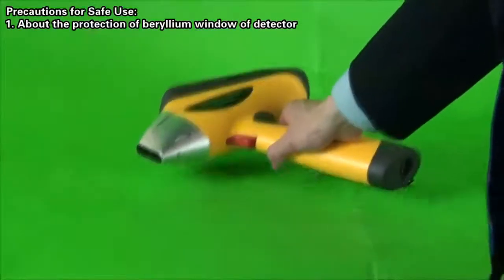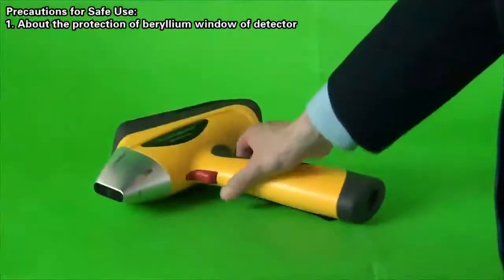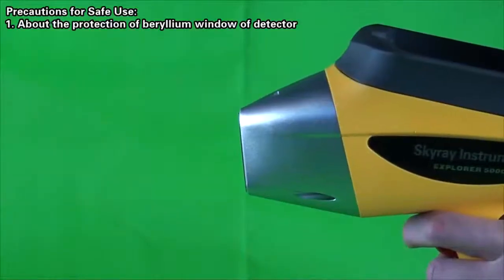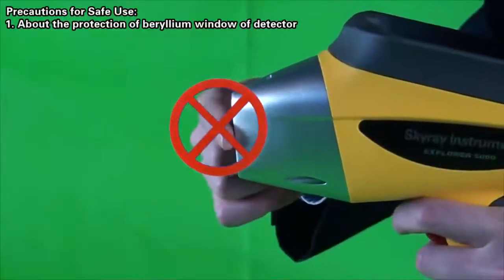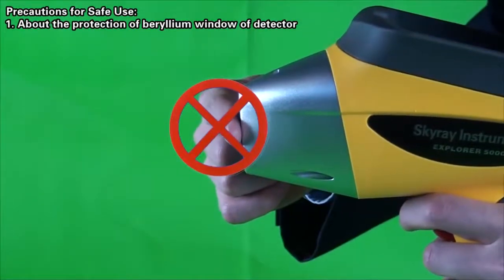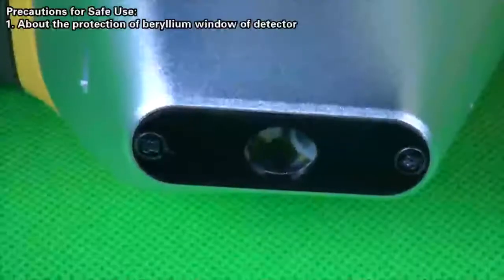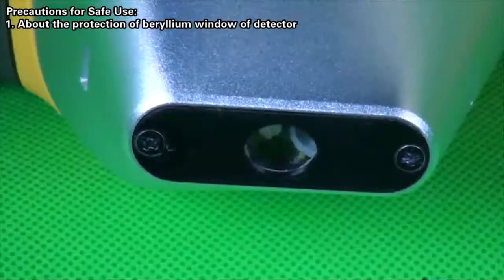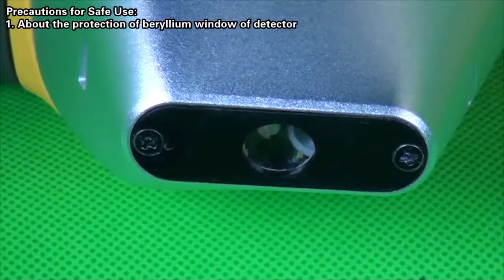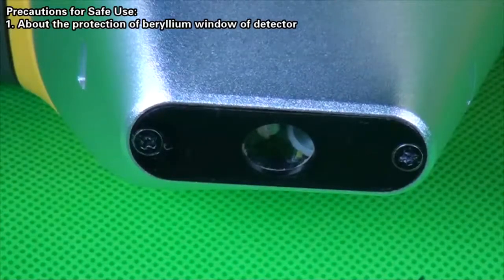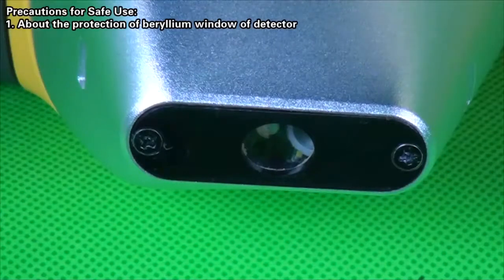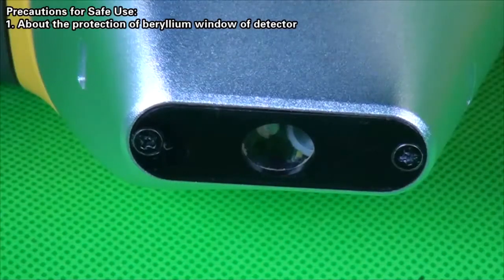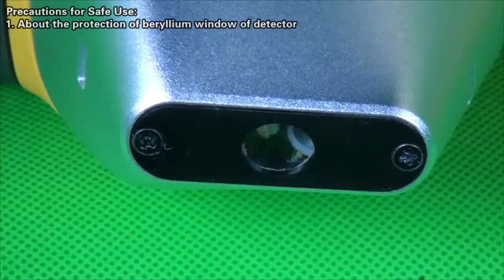Do not use fingers or fingertips to touch the window film. Be careful that the test film of window shall be kept from any cutting edge object in order to prevent the scratches or breakage of such film, which may give rise to the damage of beryllium window of detector.